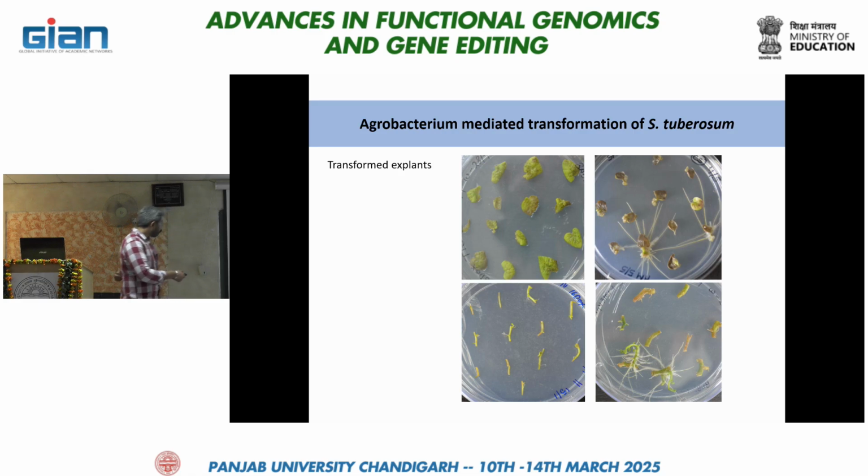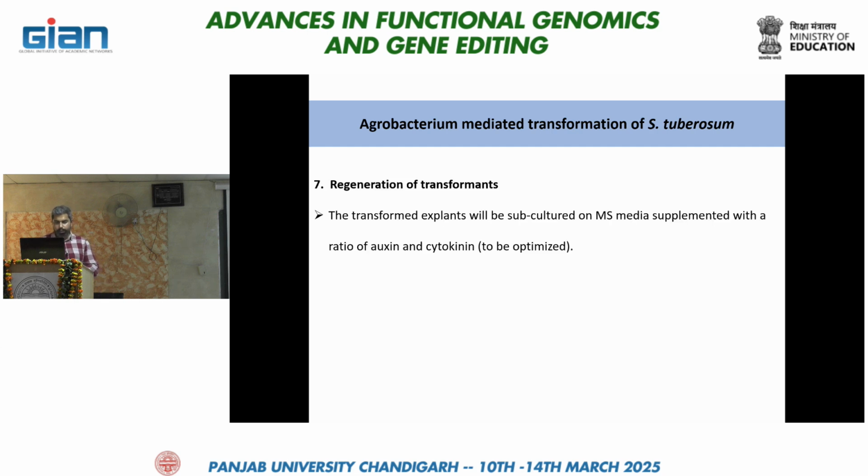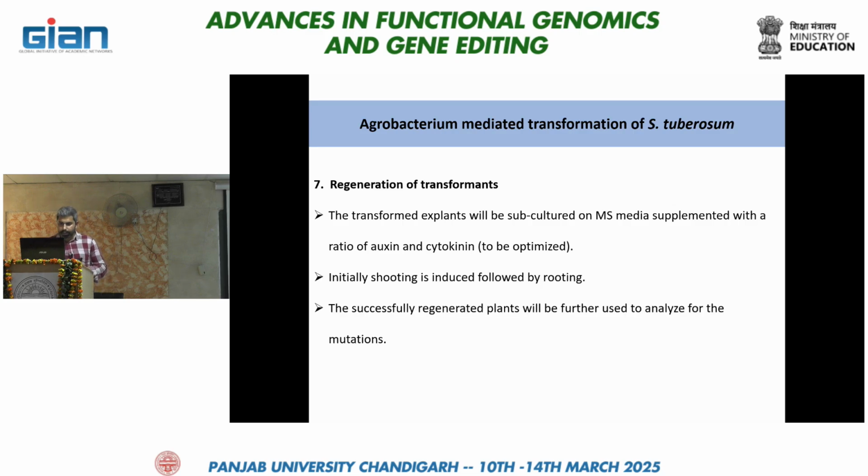This is how your transformed and non-transformed plants will look after some time. In our case, it took around 1 month. After selection of the transformed plants, the next step is the regeneration part as well.